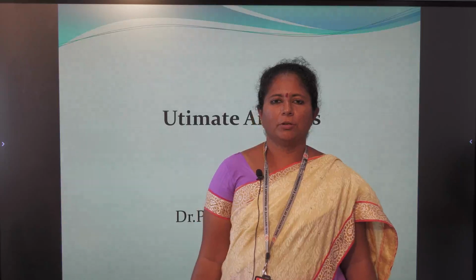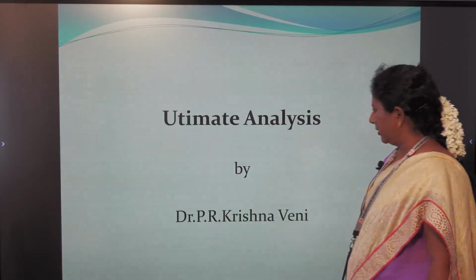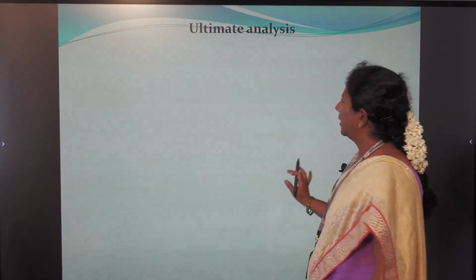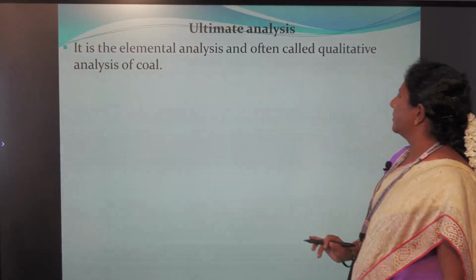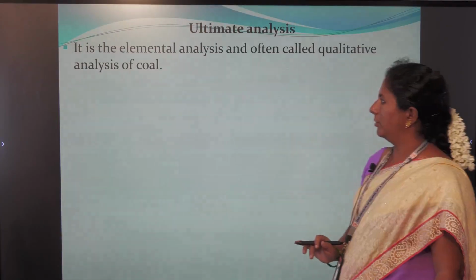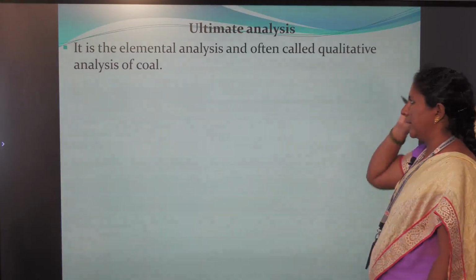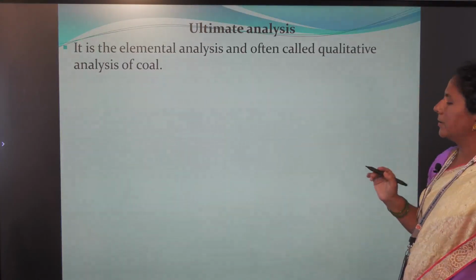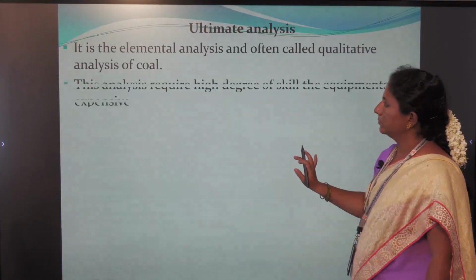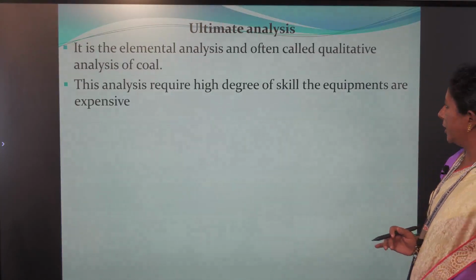Welcome to the lecture on ultimate analysis. In the earlier lecture, we have discussed about the proximate analysis. Proximate analysis is the quantitative analysis of coal, and here ultimate analysis is the elemental analysis and is called as qualitative analysis of coal.